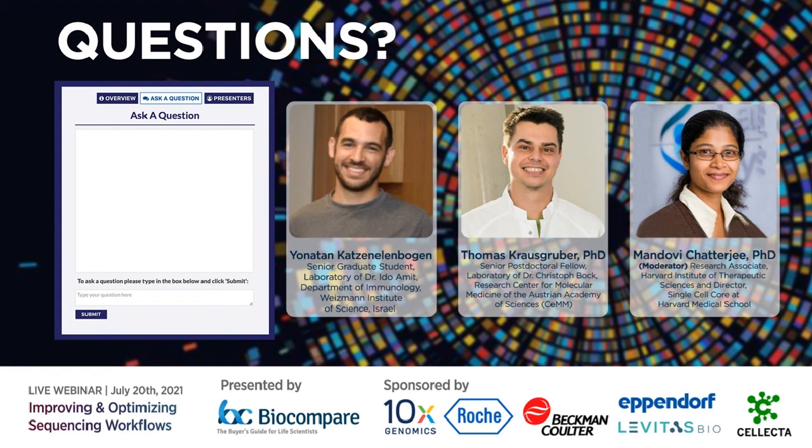Thanks. Thomas, do you have any comment on that regarding how to work with sample types? Yeah, maybe on the sorting, one approach we sometimes use, for example as an input for single-cell RNA-seq, is to sort and enrich for the rare population to get anywhere between 200, 300, 400 cells or maybe 1,000 cells, but then fill up the rest with total live cells.